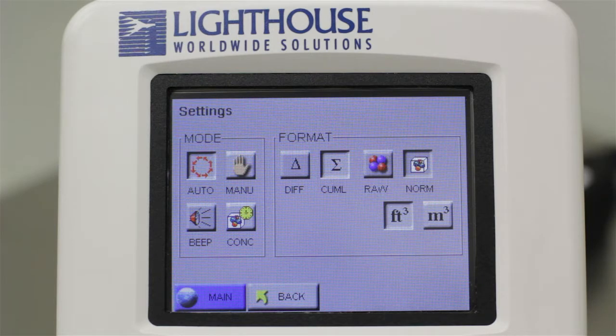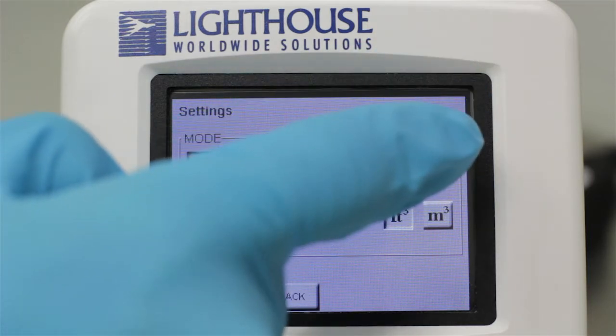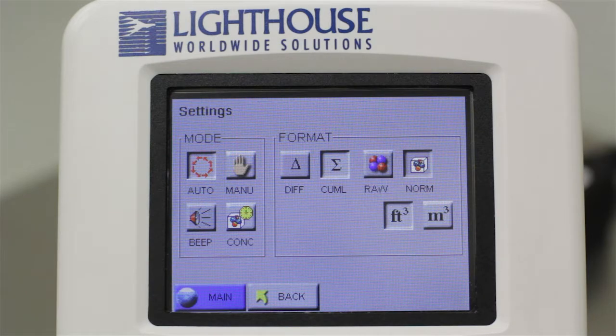The format buttons on the right determine how the particle counter will display your particle count data. For this tutorial, we will use the most common settings. Select the Cumulative button, choose the Normalized button, and then select either cubic feet or cubic meters depending on your needs. Once you have made these selections, press the Back button on the bottom of the screen.